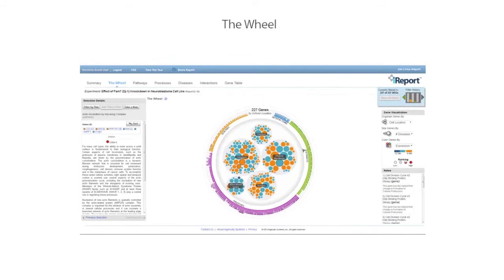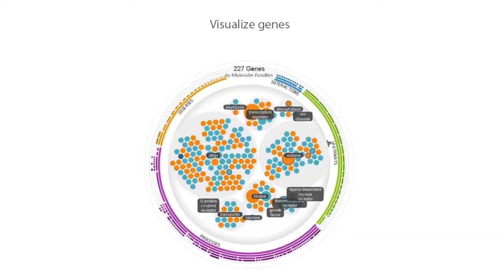The Wheel is another way you can identify interesting genes and explore your initial analysis results. As you saw before, the Wheel lets you group and visualize your significant genes in custom ways to help you understand the underlying biology of your experiment. Each gene from your results is shown as a colored circle. Here they are colored by expression, so you can quickly see which are up or down regulated.